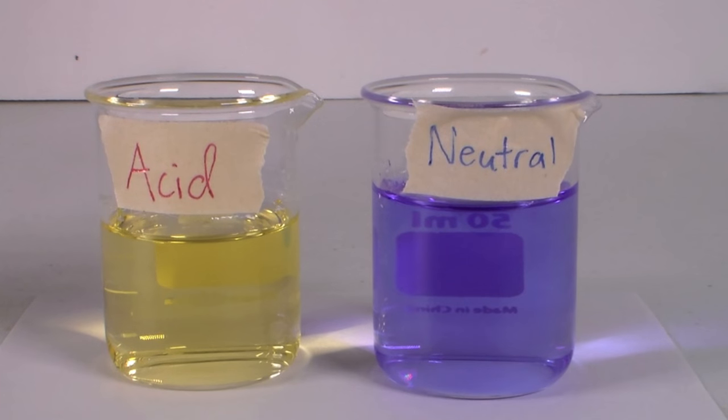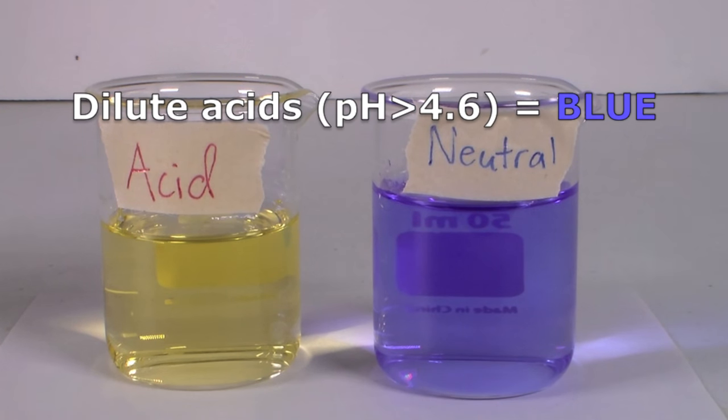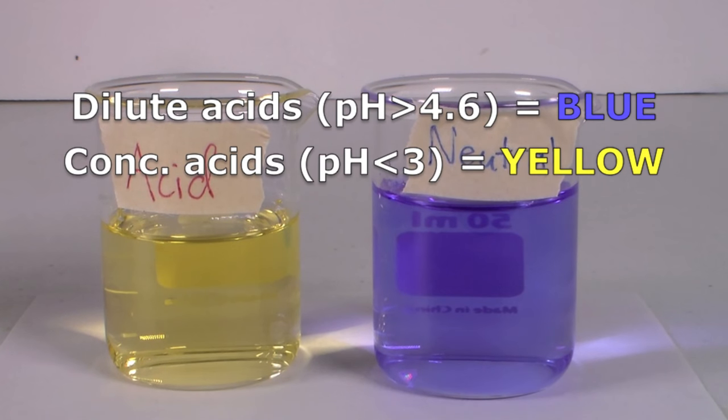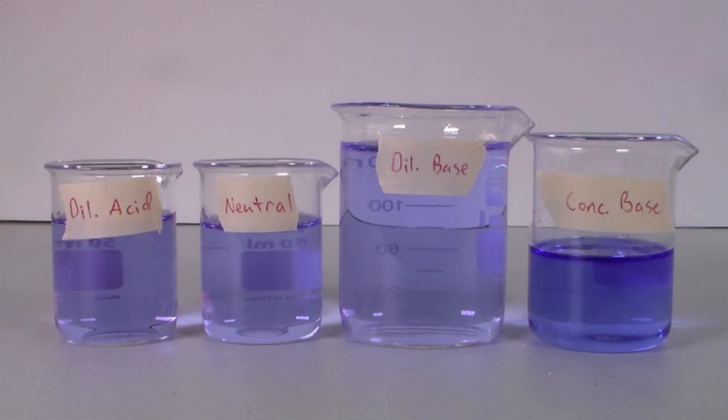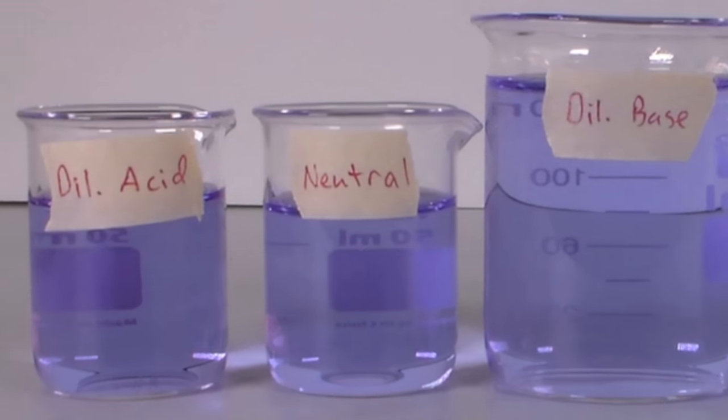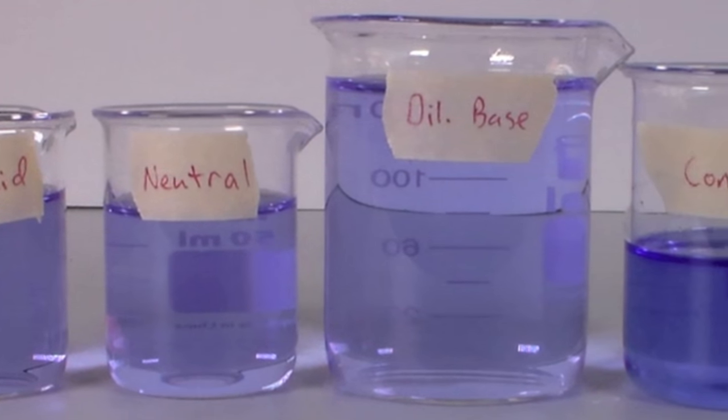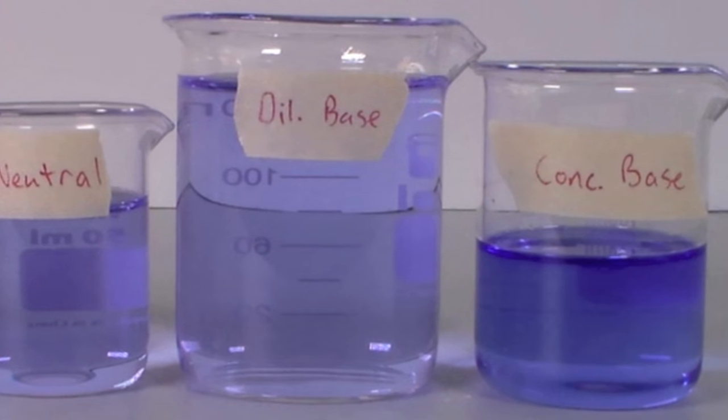Because of its pH range bromophenol blue is great for distinguishing between different concentrations of acids. If you are working with a dilute acid that has a pH above 4.6 it will turn blue. But with a more concentrated acid that has a pH below three it will turn yellow. However it's not great for distinguishing between dilute acids and bases because it will be blue for all pH values above 4.6.